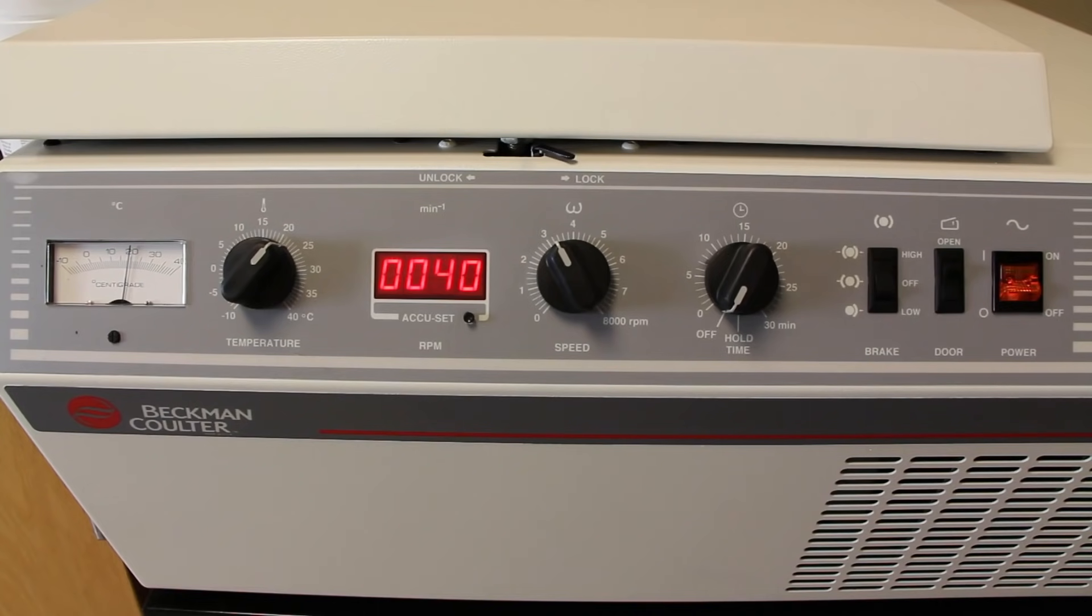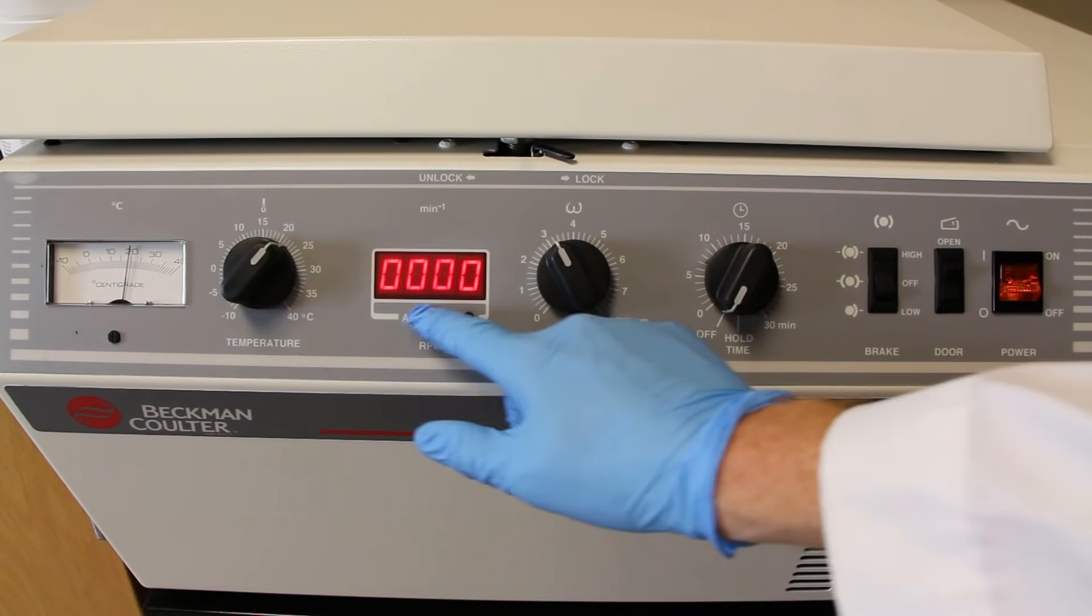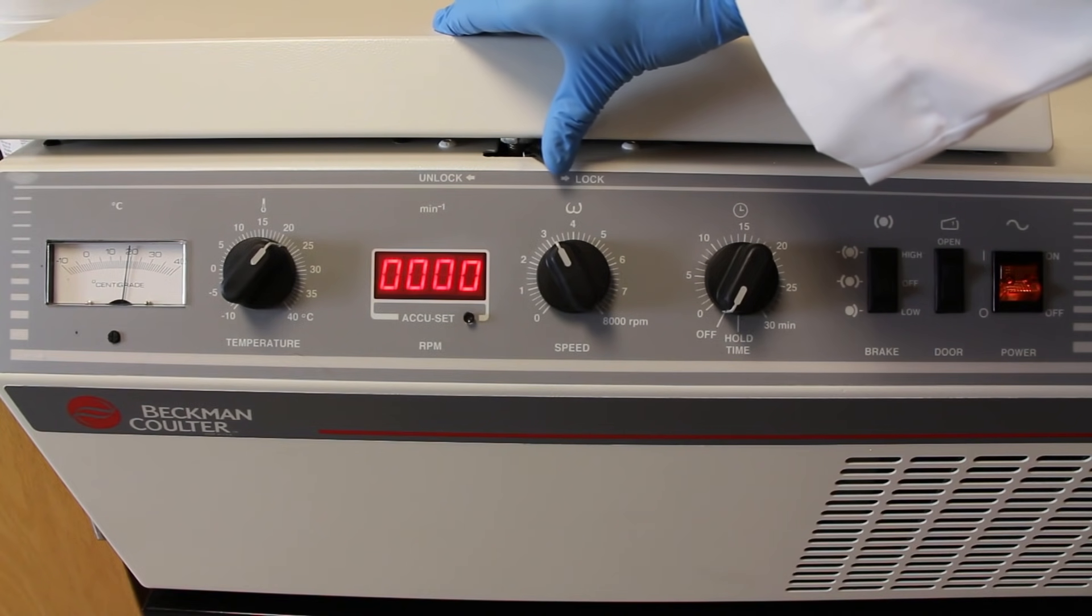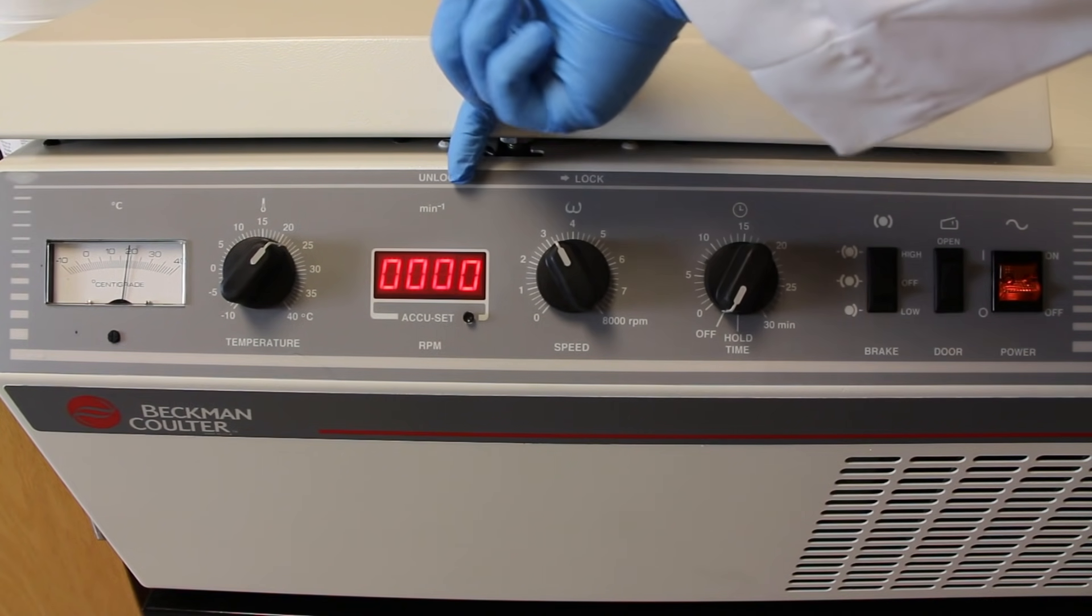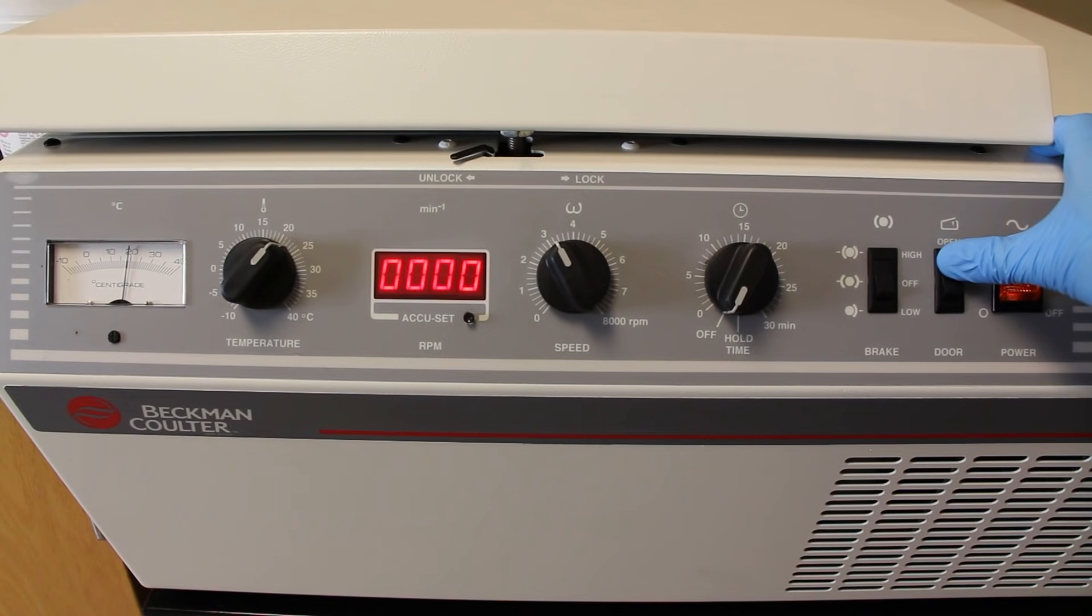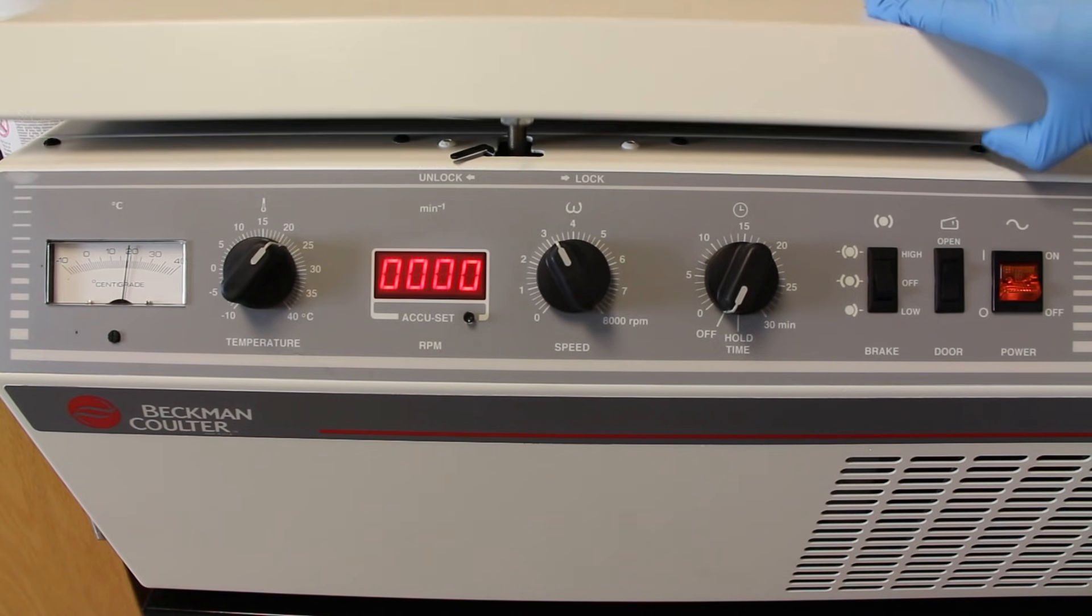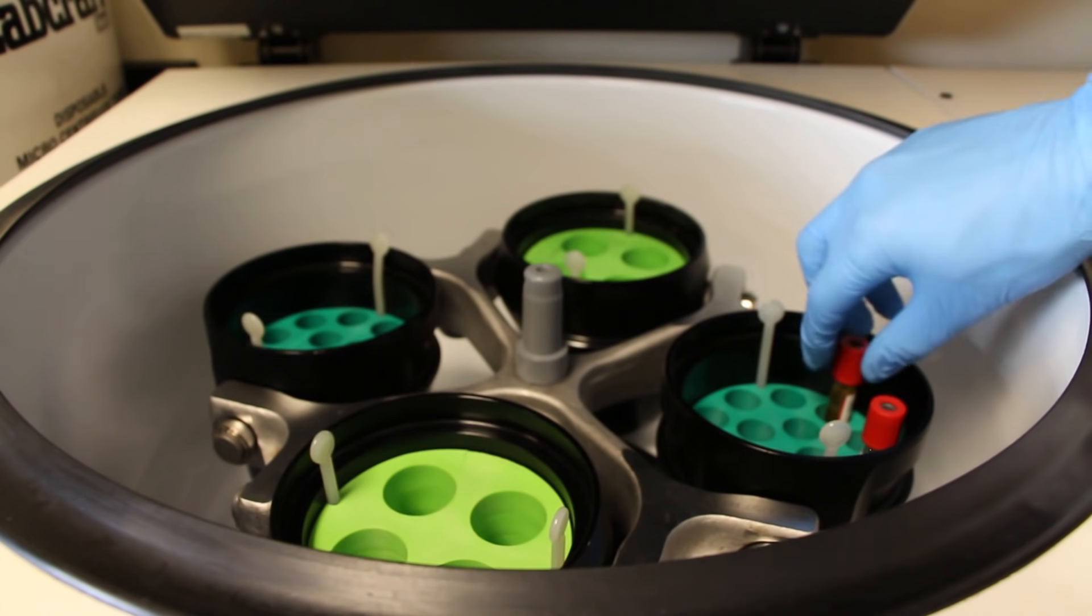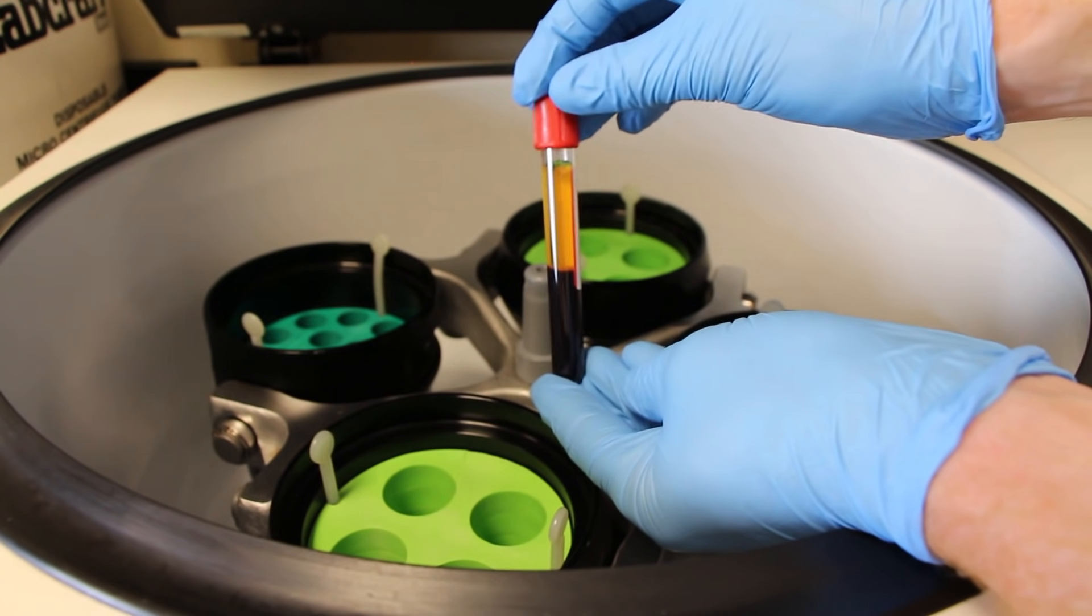Once the centrifuge has stopped, you can open it. You're simply going to flip the switch back on the locking mechanism on the lid, and then there's a button on the front of the centrifuge that you have to push to actually open the lid, so there's two different locks. Once both those locks are undone, you can lift the lid, take the samples out, and you can use them however you plan on using them.